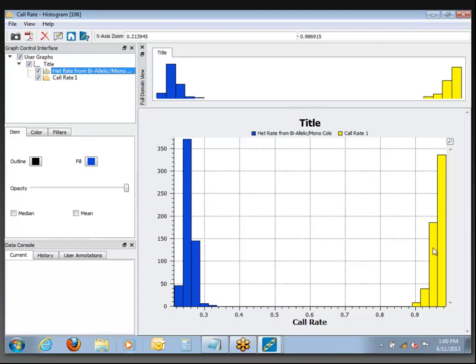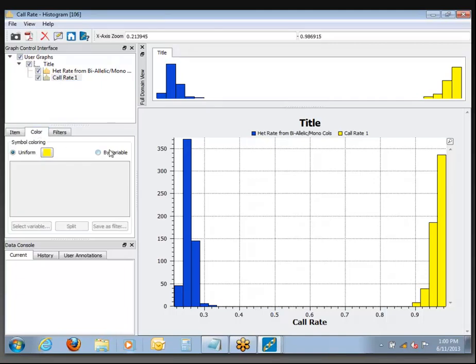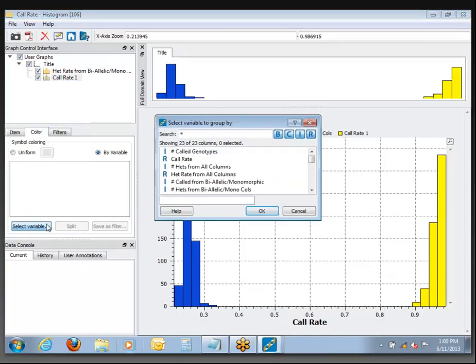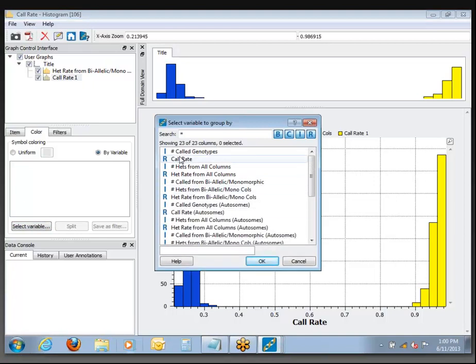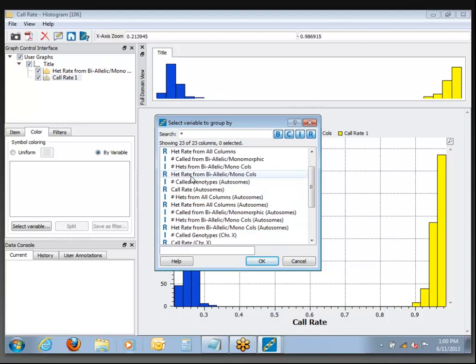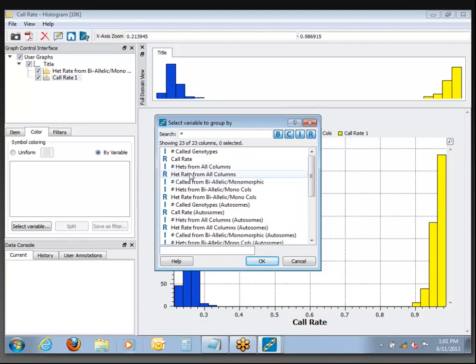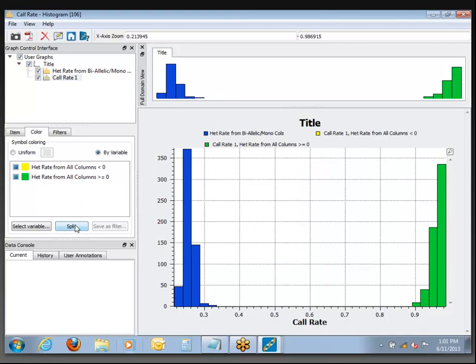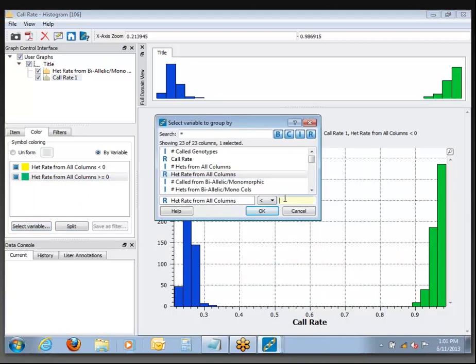You can see that the functionality is here to do a lot of different things. Also, I could split this. If I come into the coloring options and recolor by variable, I can say split this call rate based on heterozygosity rate. So let's grab the het rate from all columns — that's the one I want to use — and specify a threshold where the heterozygosity is above or below 50%.